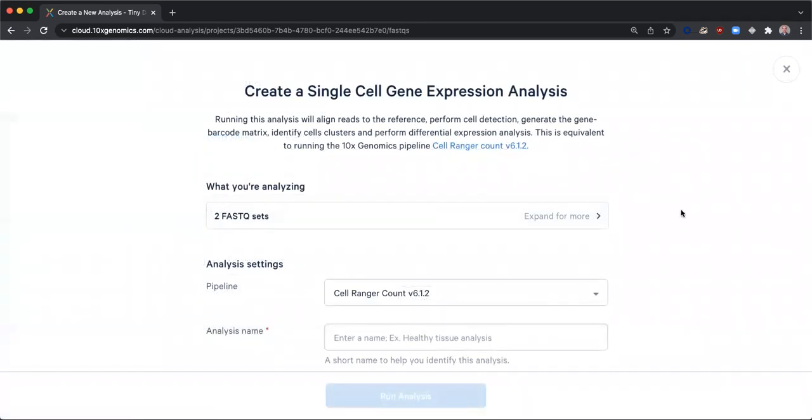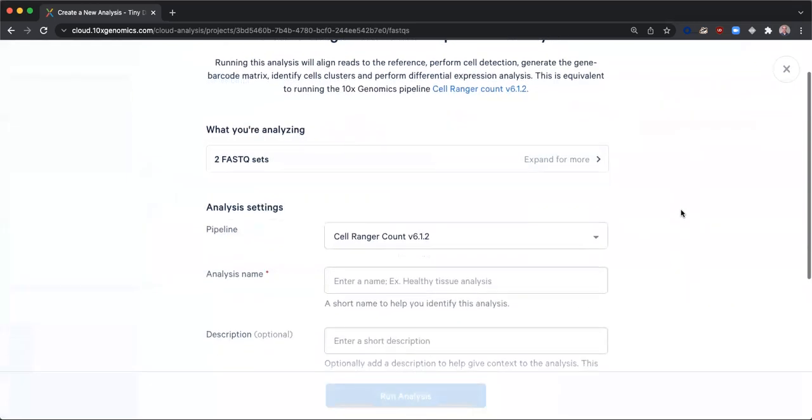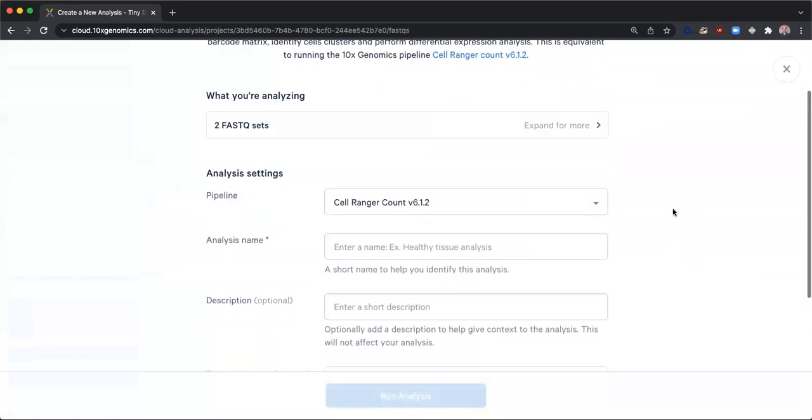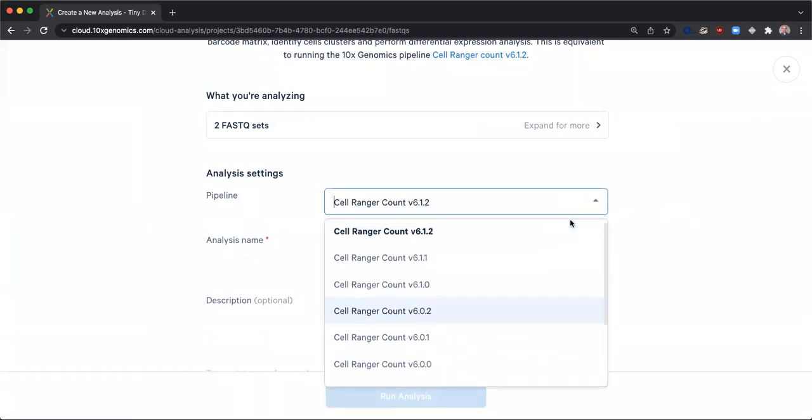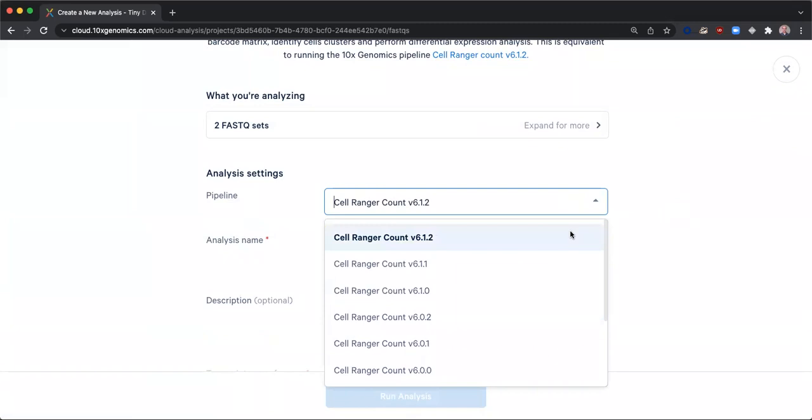Cloud analysis automatically determines a recommended CellRanger pipeline based on the types of data that are present. By default, the most recent version of CellRanger is suggested, but you can select and run any version back to version 3.1.0 via the drop-down selector.